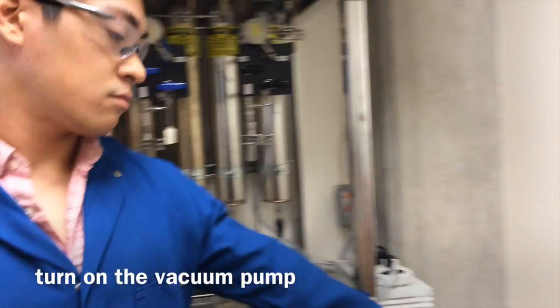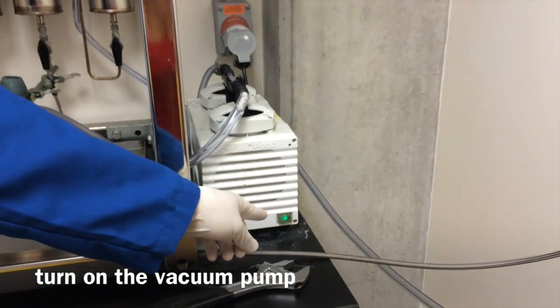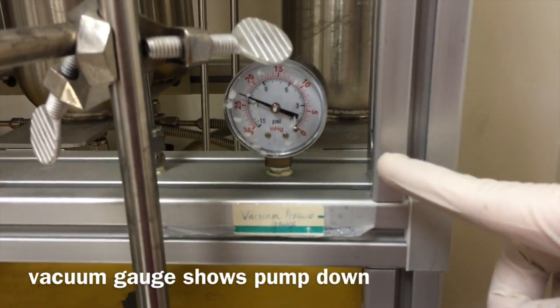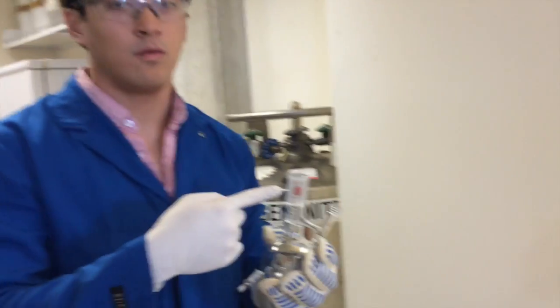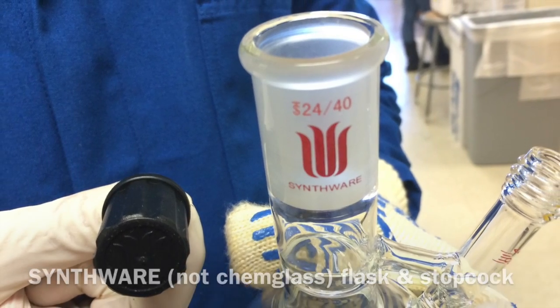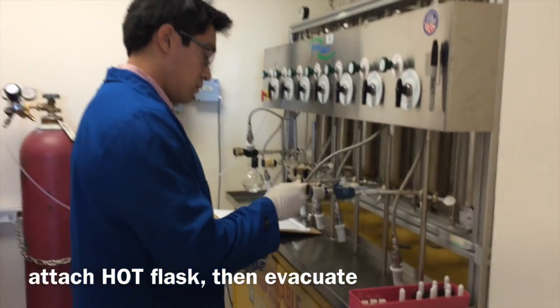Once you've checked the gauges, you can now turn on the vacuum pump to pump down the manifold. Next, Faben grabs a Strauss flask from the oven, specifically designated for use on the SPS. This is the Synthware Strauss flask with matching Teflon stopcock. Attach the hot flask and then evacuate.